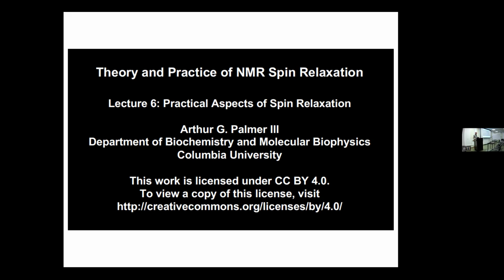But of course, you don't really care about the methyl magnetization. You want to get started on the next backbone experiment. So these kinds of longitudinal relaxation enhancements have in practice turned out to be more useful than trying to fine tune the INEPT delays, for example, for a particular protein.